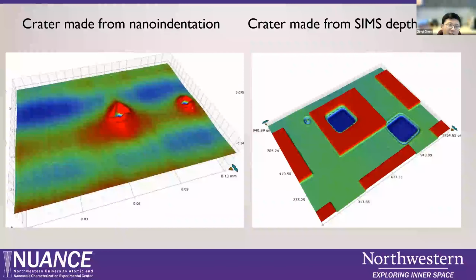And on the left, that is a very smooth surface. We did the nano-indentation, using our instrument. So that is a different force. You can see the crater is different. But after making the crater, the surrounding area is also pushed up. That is like a volcano, open like that. So that gives you a view of how it looks after indentation.